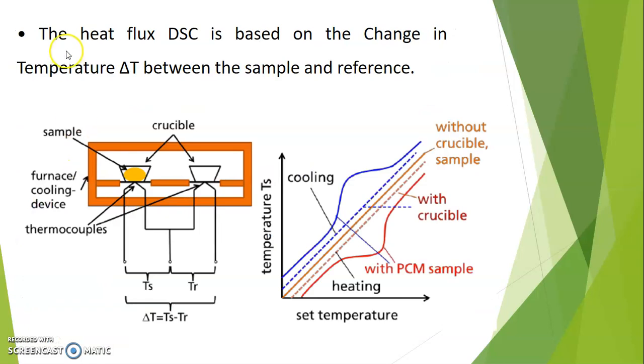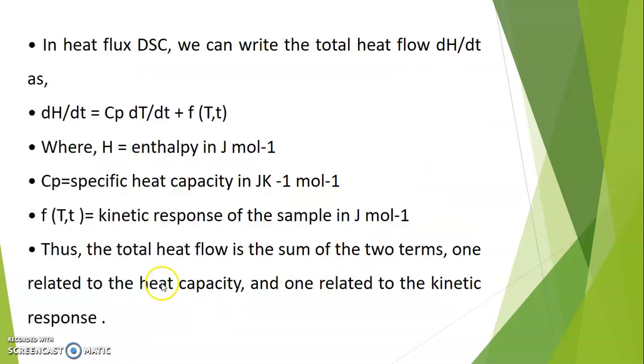The heat flux DSC is based on the change in temperature between the sample and reference. Here you can see the block of the instrument where sample and reference containers are present. It is attached with the thermocouple, and here we determine the difference between the sample and reference.